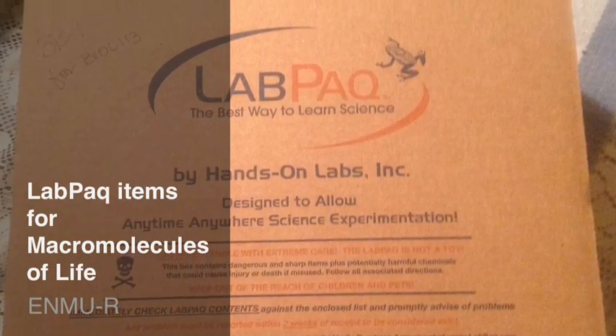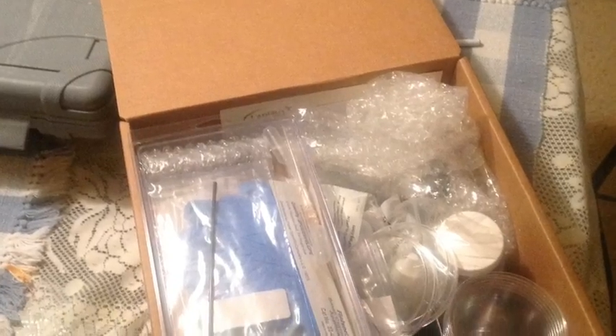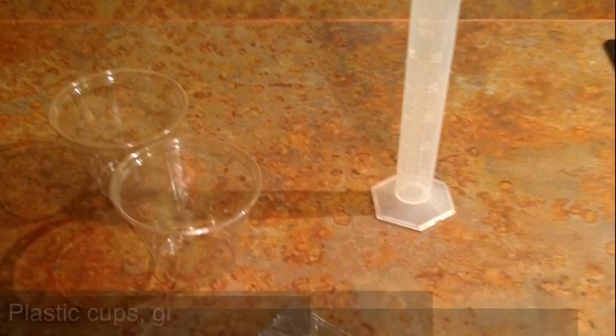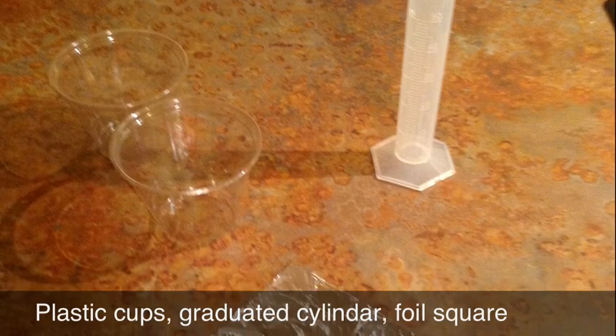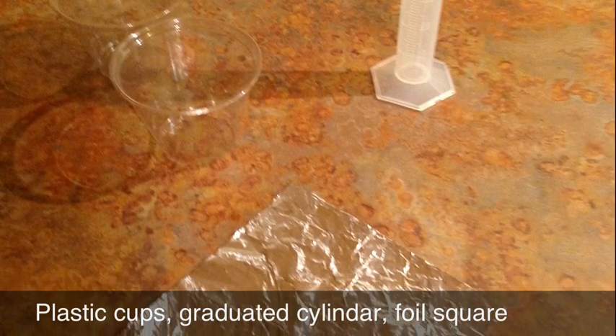To complete the Macromolecules of Life Lab exercise, here are the items you'll need from your lab pack kit. Two plastic cups, the graduated cylinder, and the foil square.